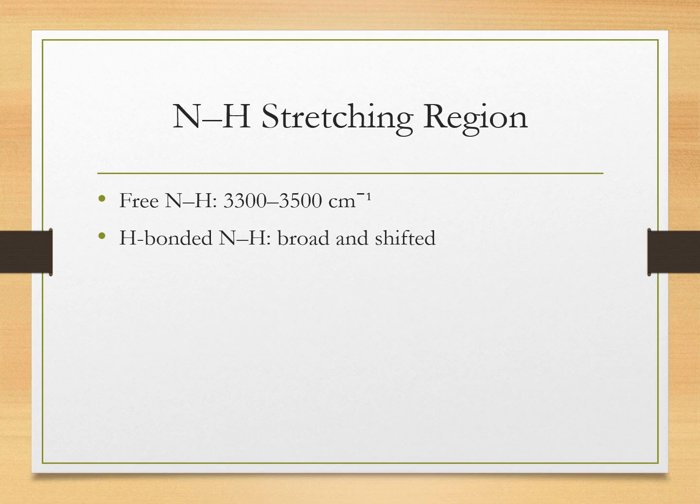Now the NH stretching region is discussed, as the NH stretching frequencies are similarly affected. In case of free NH bonds, stretching frequencies are affected: free primary and secondary amines show sharp peaks near 3300 to 3500 per centimeter.